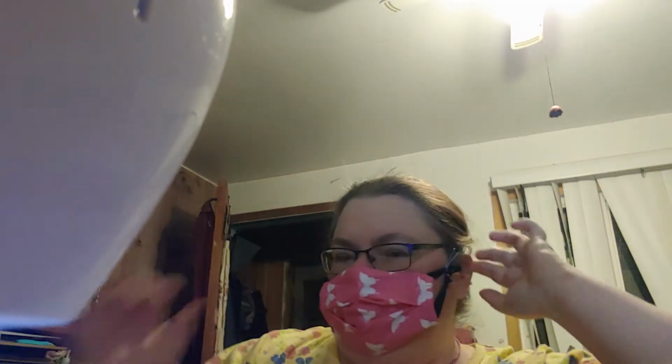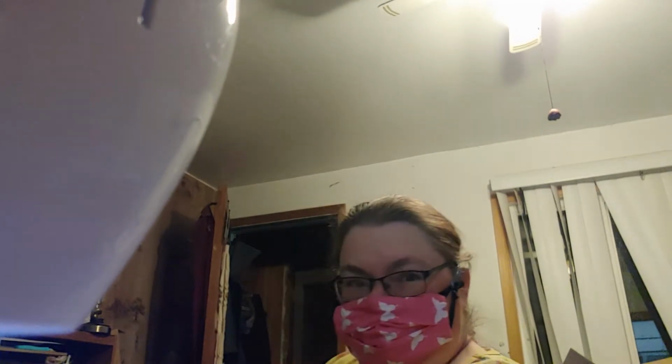So you open these up like this, and look at the joy of having glasses. They get all foggy. So it's fitting snug, and as you can see, hopefully, hold on. The elastics are around the snaps rather than your ears, okay?